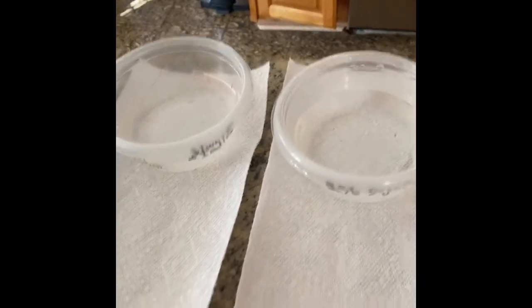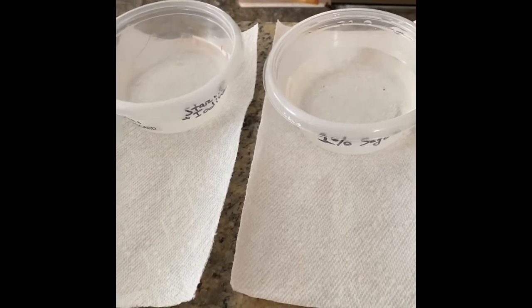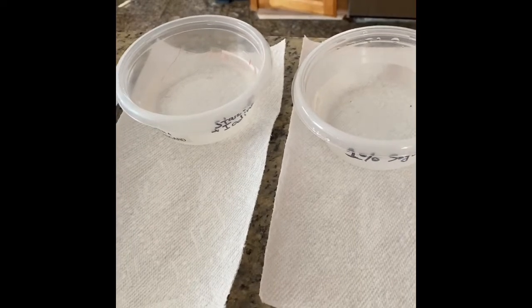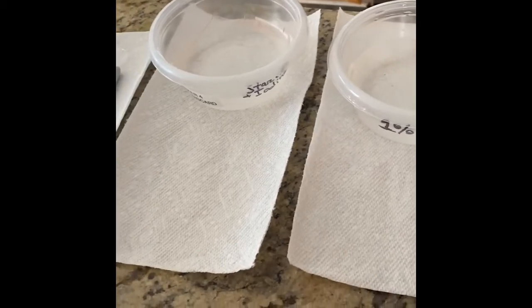Hey, good morning. We are in our virtual lab, and today we are going to study how selectively permeable membranes work. We are going to see how diffusion works and how osmosis works. To do so, this is what we need.